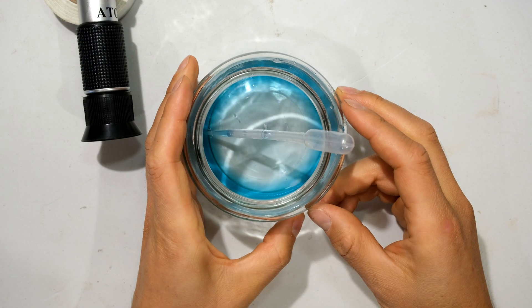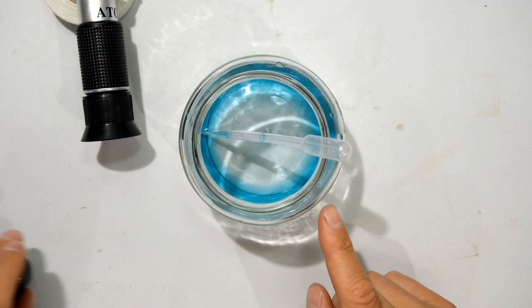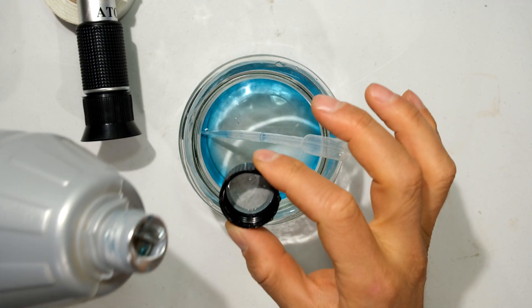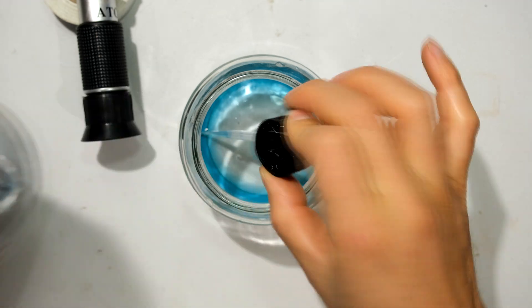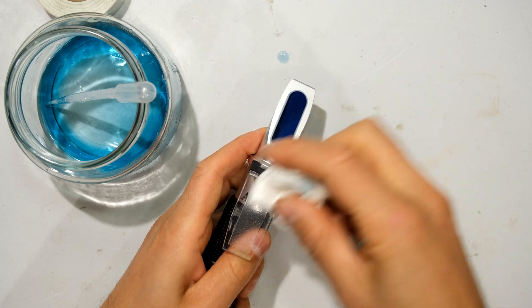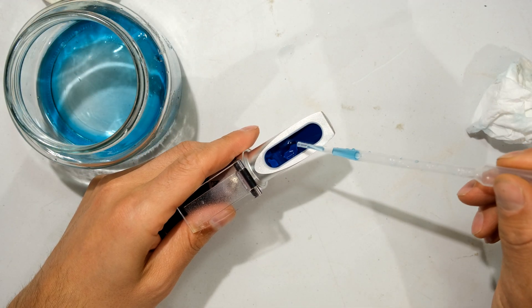Now I'm going to add one more cap of antifreeze, which will take this to a 50/50 percent mixture. I'm cleaning the prism and the daylight plate, then putting two drops on the prism.